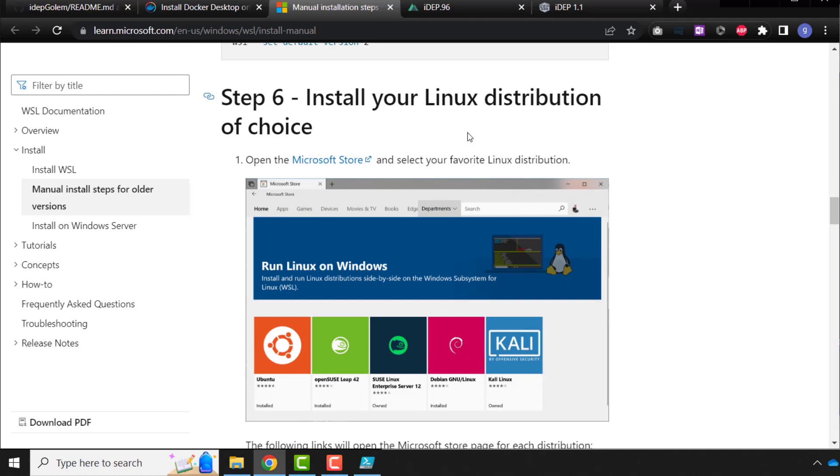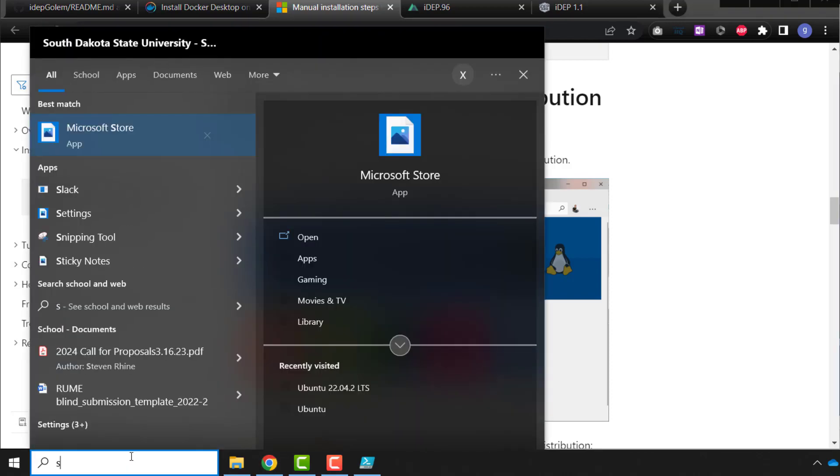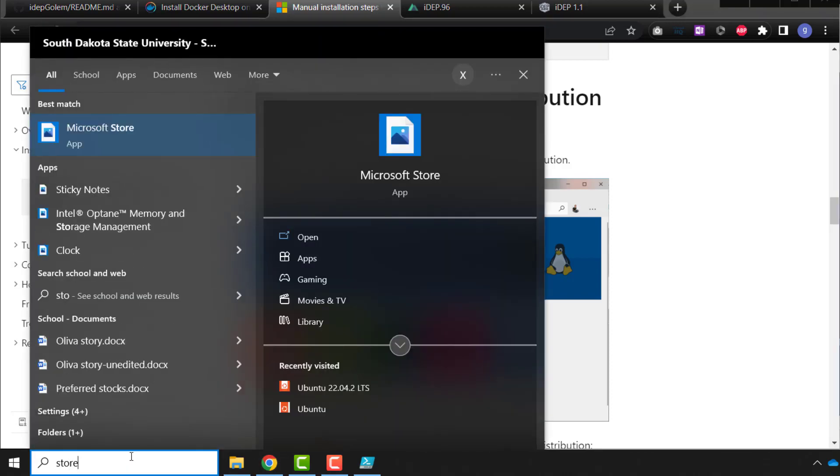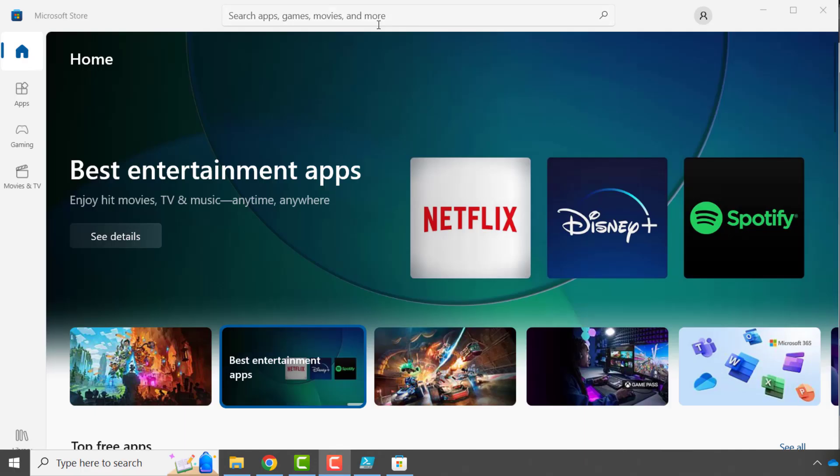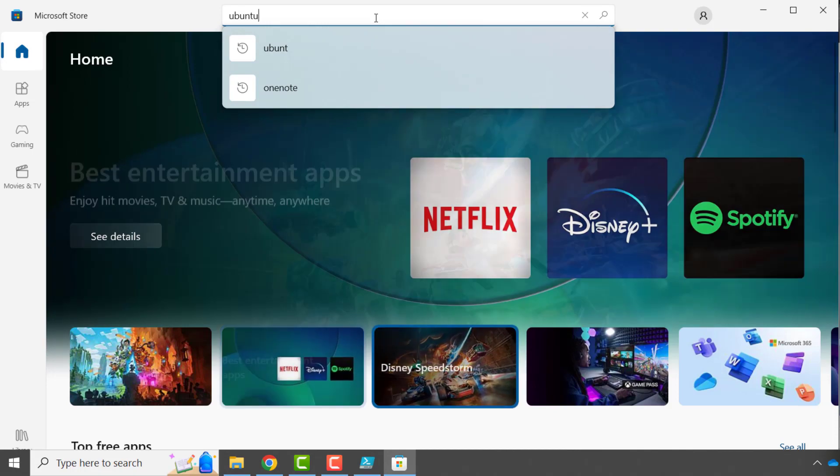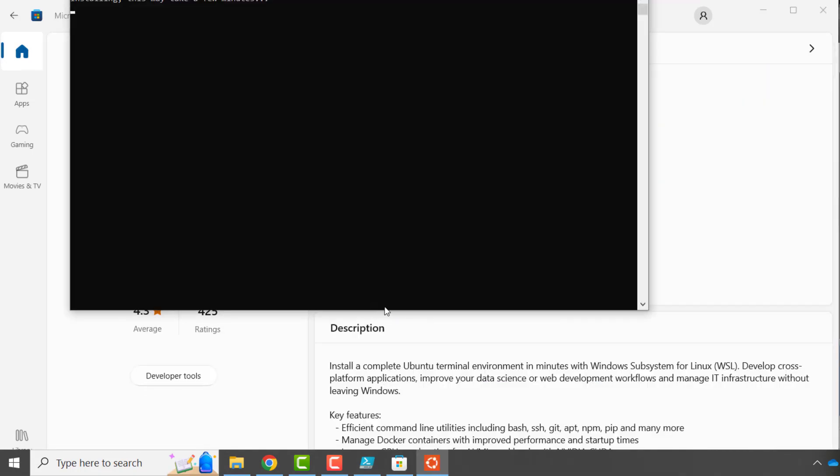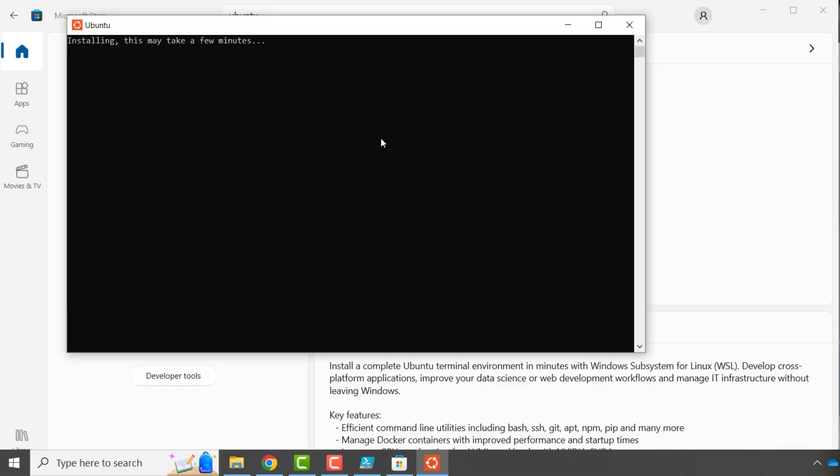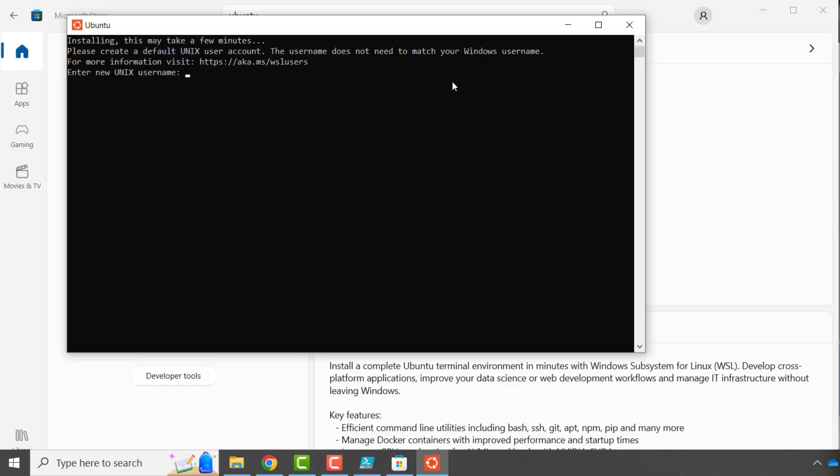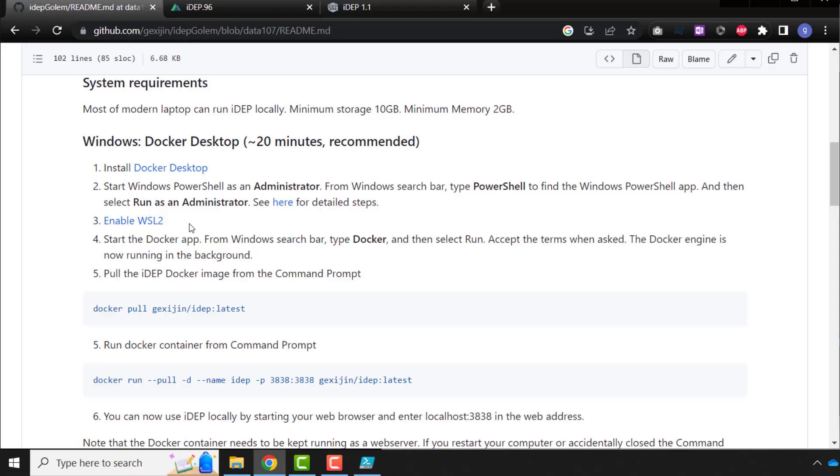Install Linux distribution, Microsoft Store. So open in Microsoft Store. Store is open, so we search Ubuntu, get, open. Then, the first time, enter Unix username. So that's all, that's finished. So we already done that, so start the Docker app.